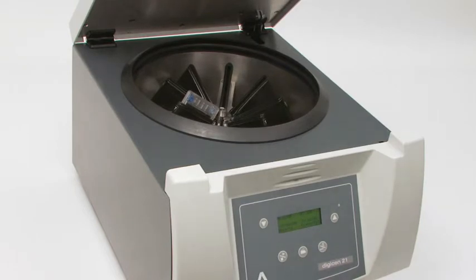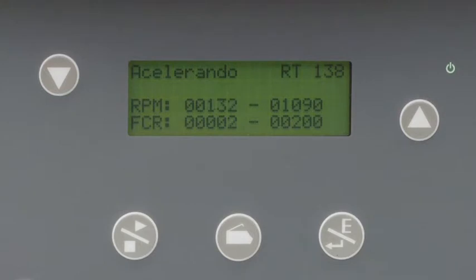Introduce the petaka into the centrifuge rotor pocket in this way. Set the desired speed and time and begin centrifuging.